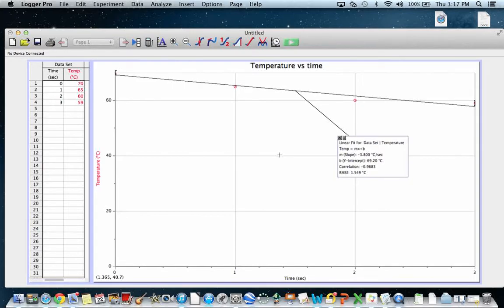And you've created a lovely graph with the correct labels, which you always need, a title, and data with point protectors, which is always nice for a teacher. This should get you going. You can click on a lot of the other things to see what some of your other options are, but this is a good basic start.